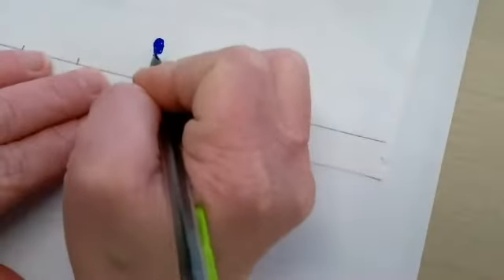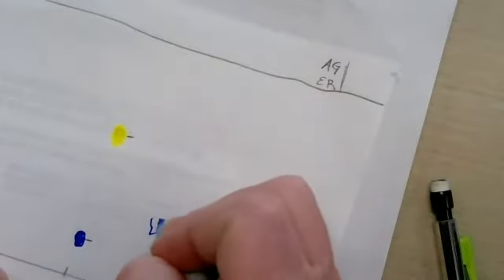You're also going to make a mark in the middle of each colored blob, if you will. So I'll judge that to be the middle and that to be the middle. Maybe the blue, I'm sorry, I'm using the same color, made a blob like that, and maybe there's some right there. So I would judge right there and right there.